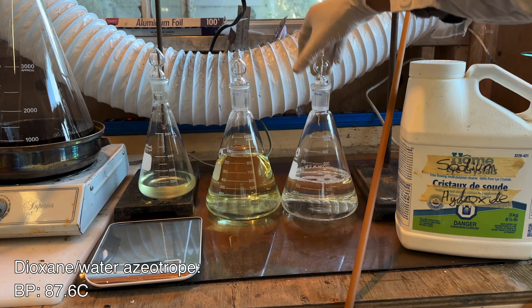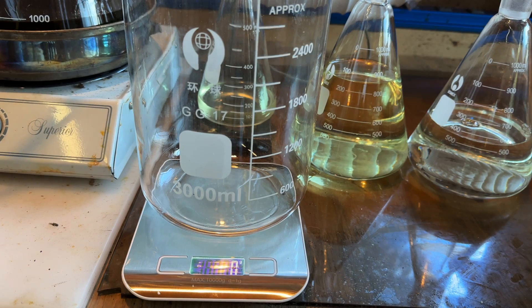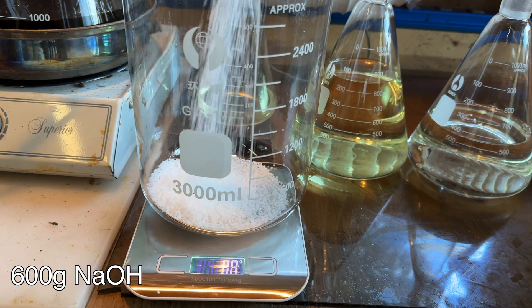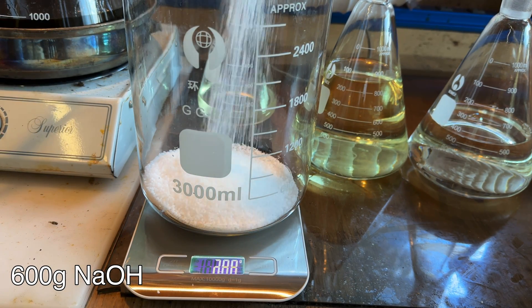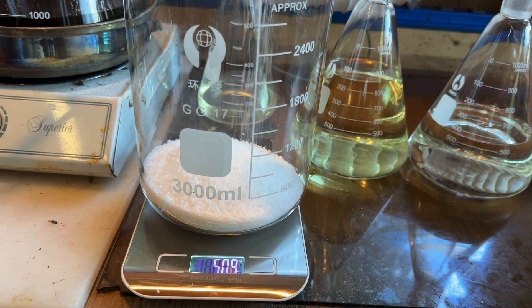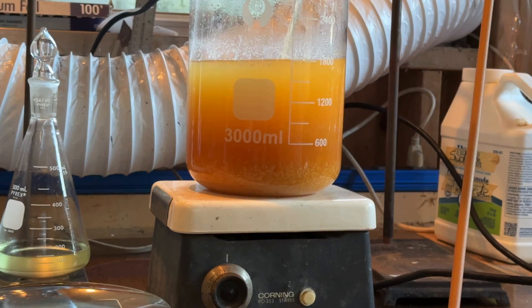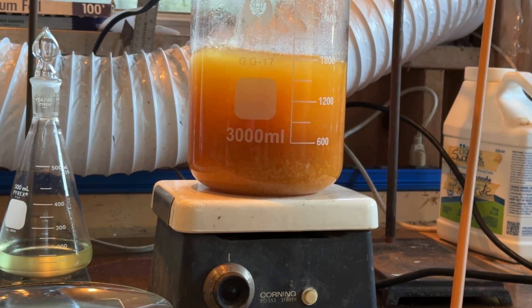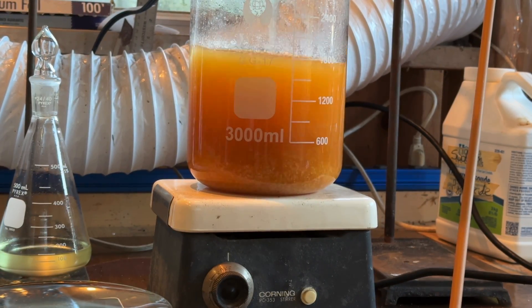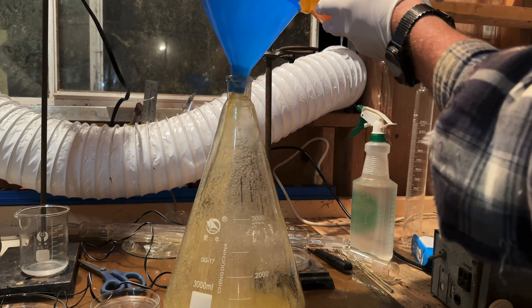To further purify the dioxane, 600 grams of sodium hydroxide was added in a large beaker. Sodium hydroxide can be purchased as lye from hardware stores. The sodium hydroxide dissolves the water present in the solution and forms a separate layer at the bottom. The dioxane was left stirring for an hour or so to allow complete removal of water, and then the upper dioxane layer was decanted into the distilling flask.